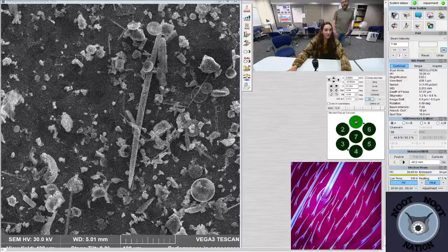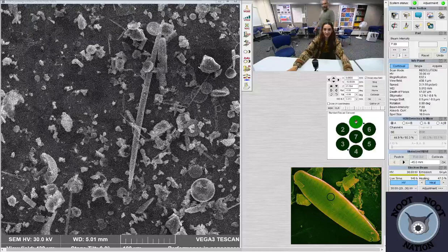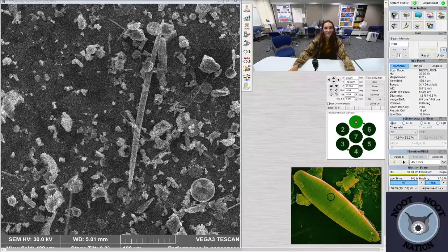This one's sponge spicule, right? That's a sponge spicule, yes. People are listening to me now? I believe so. Wait, let me double check. Click on the, yeah, when you talk, they can hear it. Oh my god, okay. I'll leave you alone for 1 minute.